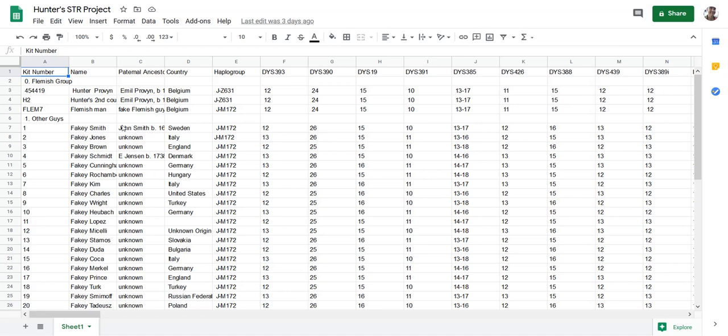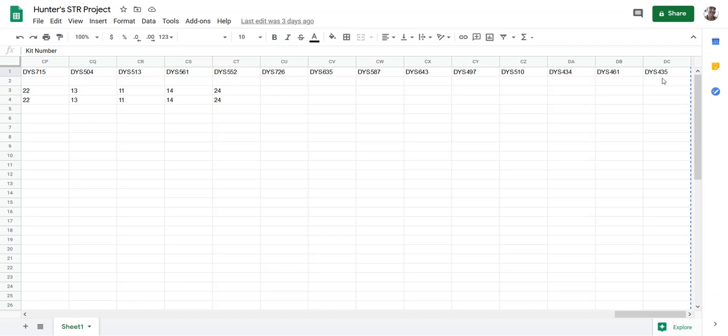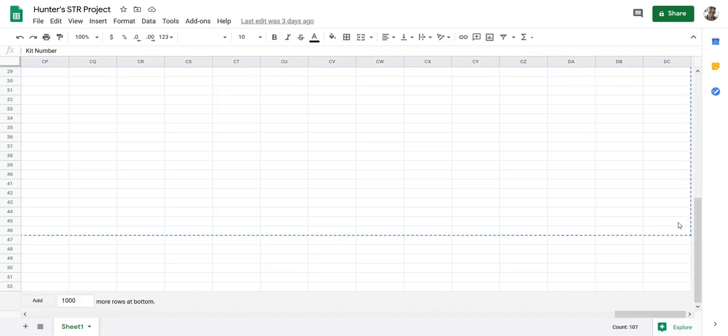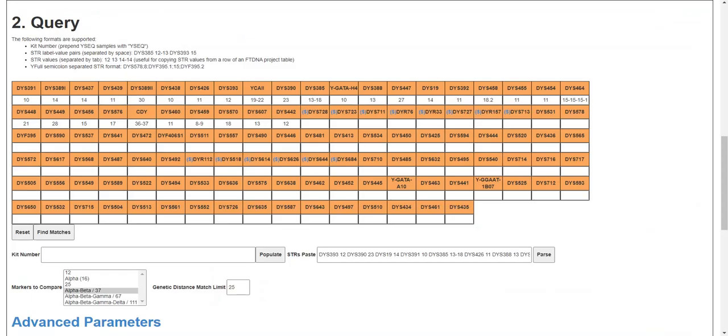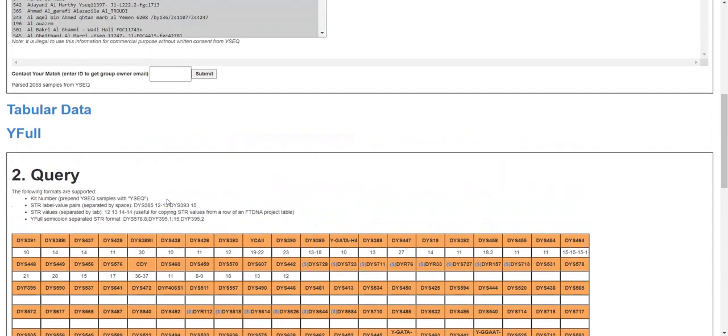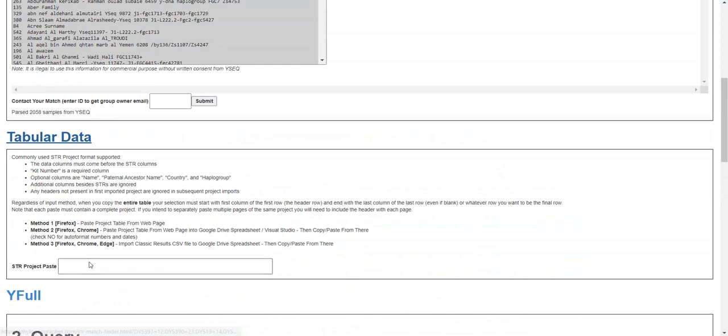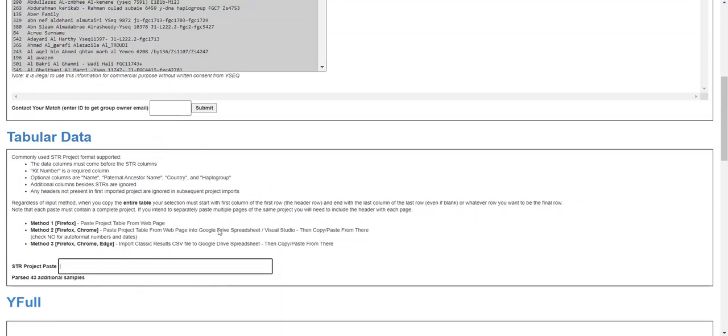You can enter this data source if you just copy paste the whole thing starting at the top left and go all the way to the right, and then go all the way to the bottom. Whatever last row you want, copy it, go here to tabular data and just paste it in there. It worked, 43 additional samples.